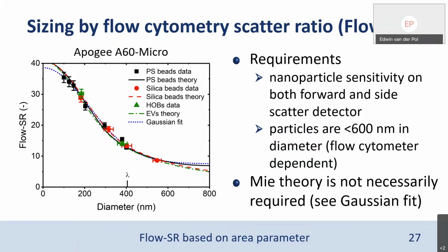The question about adding an extra scatter detector, I think it's very valid. Actually, there was a paper out there in 2012 of the group of Maltsev, and the paper was by Konokova et al. And they did angle-dependent light scattering measurements of single particles in a flow cytometer. So instead of 2 angles, which you see here, they measured, I think, several tens of angles.